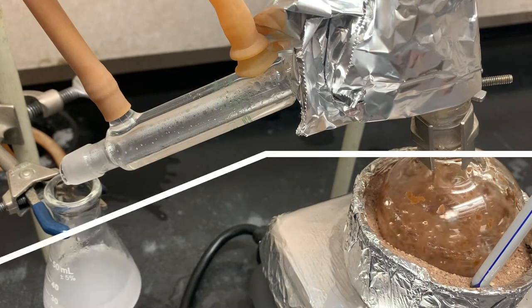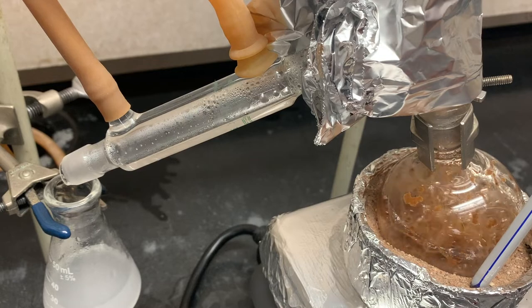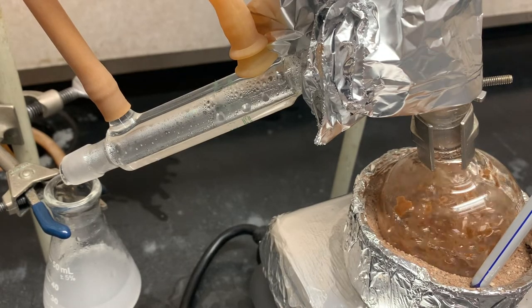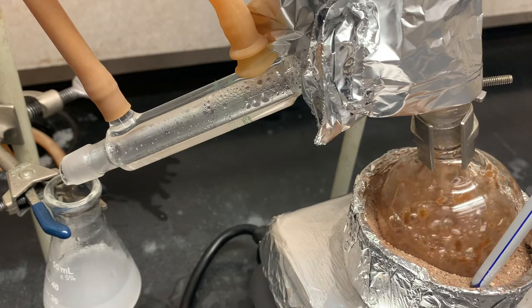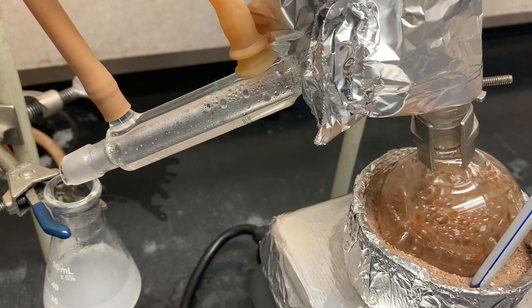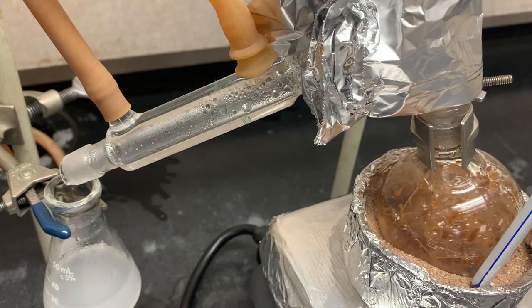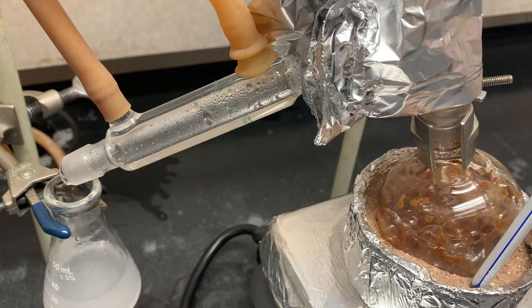Now notice how at this point a bunch of the grounds are sticking to the sides, the bubbles are coming up real strong. This is the point that you're probably near the end, where you won't be able to get much more out before you get some of the brown stuff. Once we've recovered about 35 mils of distillate, we can go ahead and pull this off the heat.